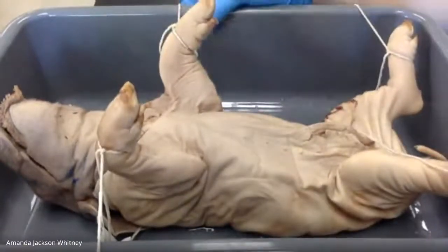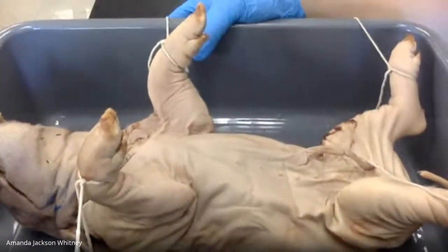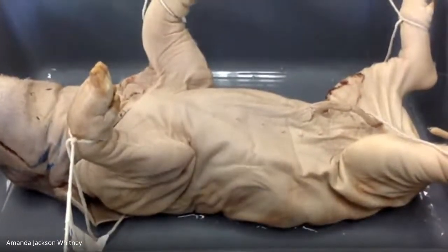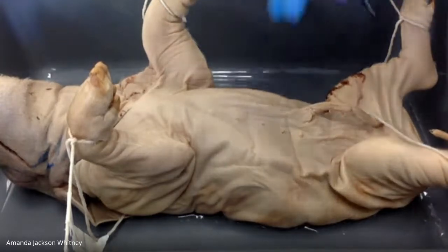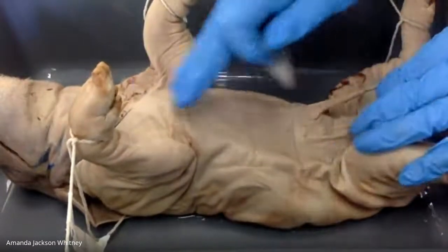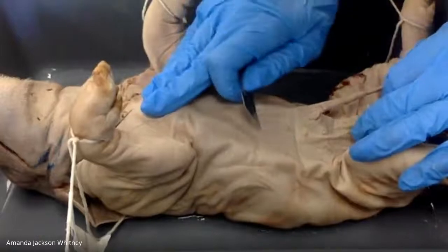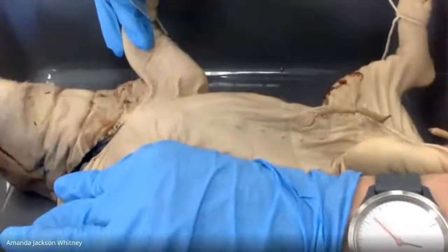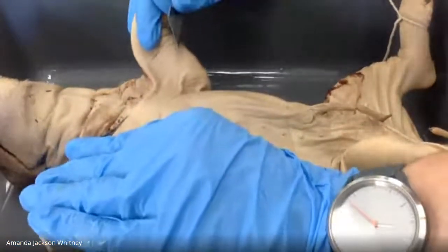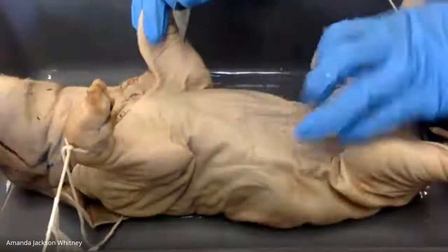But I have a lot of students missing today for AP testing, and so we have an opportunity to cut into 2 pigs. So I'm going to take that opportunity today. So this is Louie. Louie has not yet been dissected in the abdominal cavity, but we're going to just move up to the thoracic cavity today. Before we do that, though, does anyone have any questions, comments, anything around the abdominal cavity?